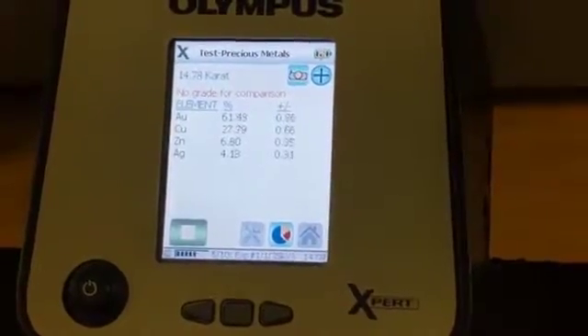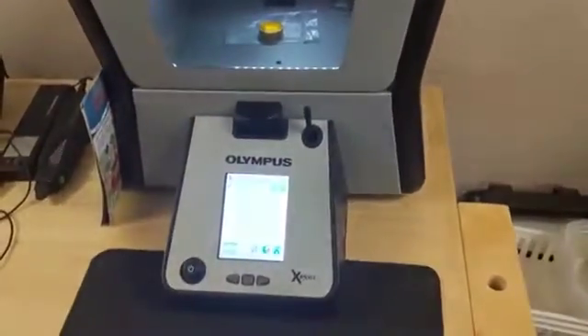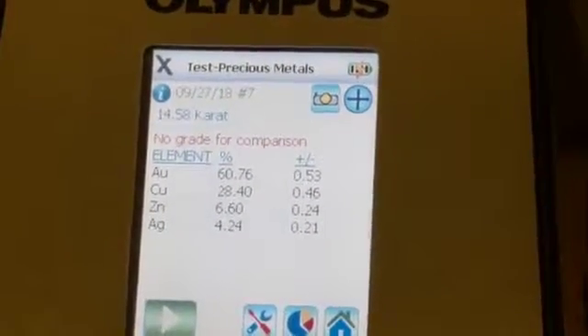It's already indicating this is real nice 14 karat gold. It's not half-carated — a lot of 14 karat gold is. On this piece, it's done now. It's telling me it's 14.58 karat. That's an extra half of a karat that we're able to offer on your jewelry.